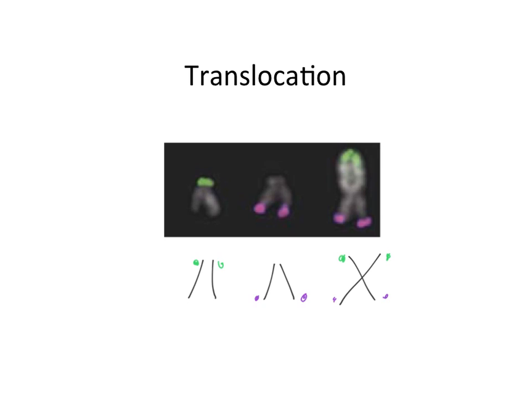So when we look at this metaphase chromosome spread, there's something strange going on. Normally we see pairs of chromosomes that have the same fish signal hybridization patterns. But in this case, we still do have diploidy, or 2 copies of every chromosome. You'll see we've got 2 chromosomes that hybridize to the green probe, and we also have 2 chromosomes that hybridize to the purple probe.